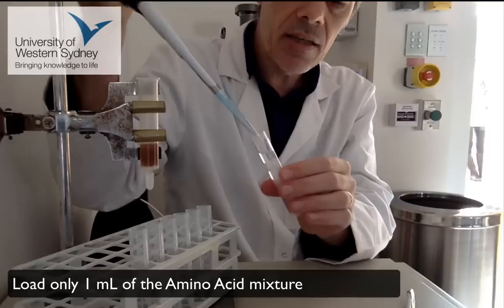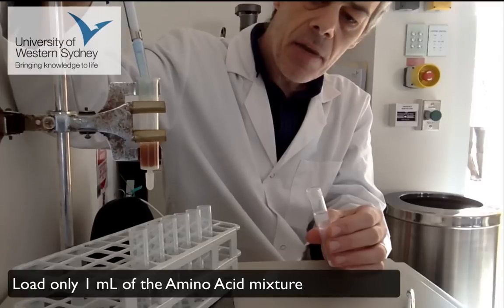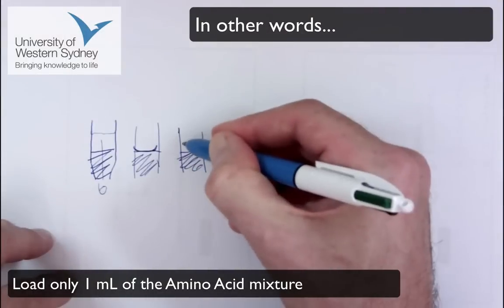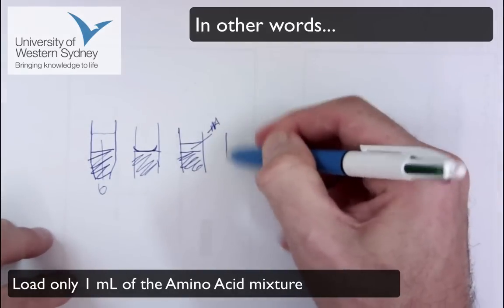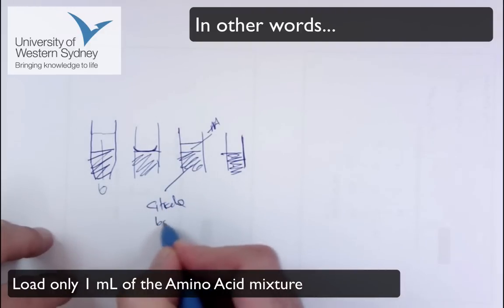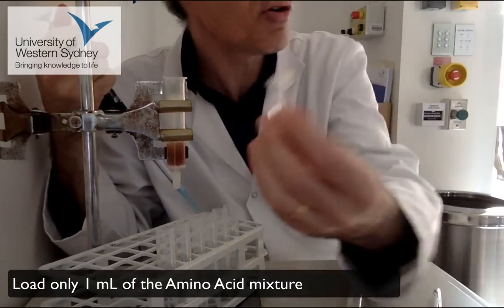So when you're loading your amino acid, you get your mil and you just dribble it down the side of the tube gently. You can't see it in this, but I am very gently pipetting my sample onto the wall of the tube. To this matrix, you load your amino acid on the top, yeah? Now, there's a bit of confusion because in the matrix already is the citrate buffer, which was here in the column. There's my amino acid. So I've just loaded that, in theory, onto my column, okay?